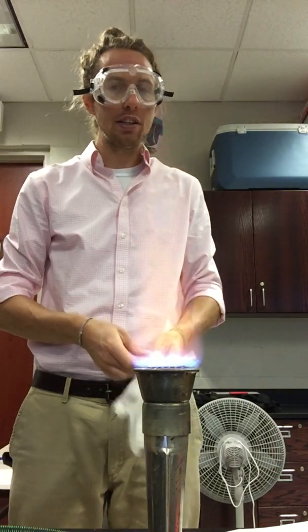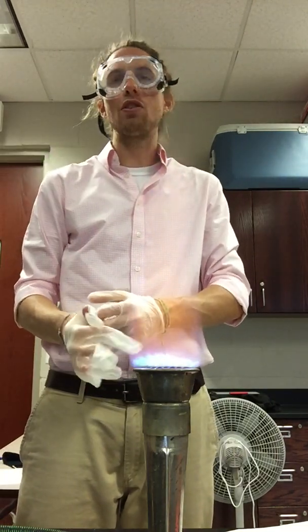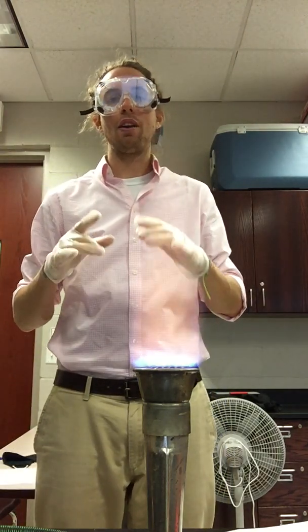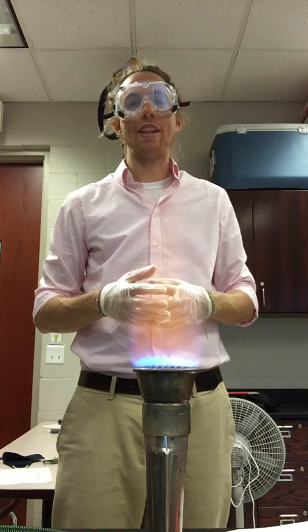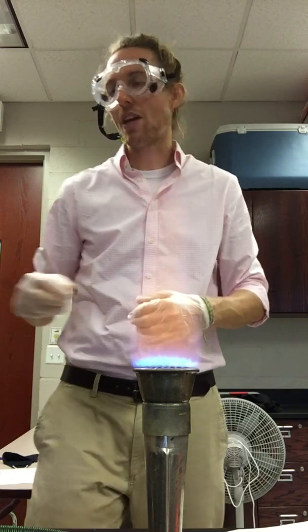I am going to basically work my way down the table with you guys, and we'll see what sorts of colors emerge as we expose different elements to the heat. A few things to keep in mind. We want to record really good data here, and that's important whenever it's something qualitative in nature, like color, that we're really specific. So imagine you're like a Crayola crayon manufacturer, and you need to give these things really fancy names so you can remember them down the road.